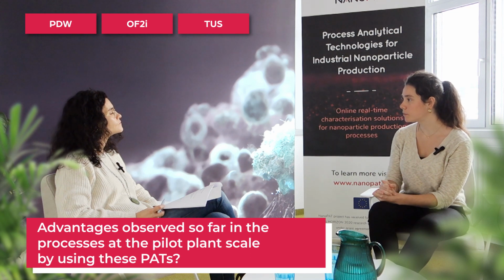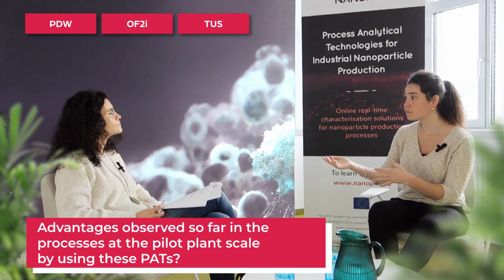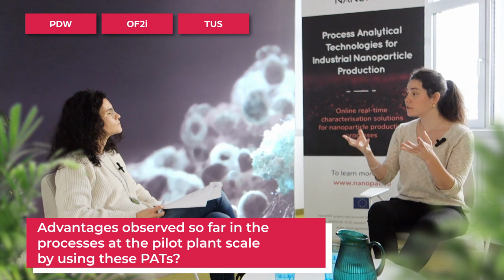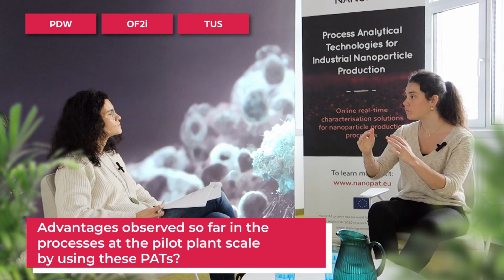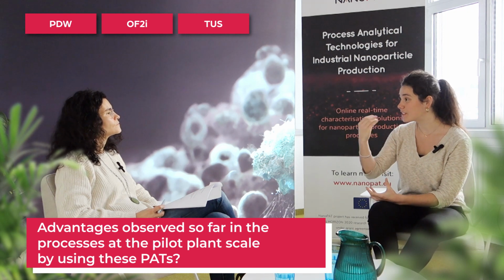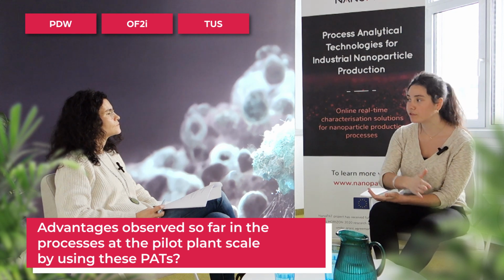So with the turbidity spectroscopy, we are measuring the transmission of the sample, and then using the wavelength exponent method, we retrieve the particle size. Observing the characteristic of this transmission curve, we are able to say if the sample was diluted enough or not. And it's something that still is very challenging in a lot of online measurement techniques. Most of them, you need to know the dilution beforehand.